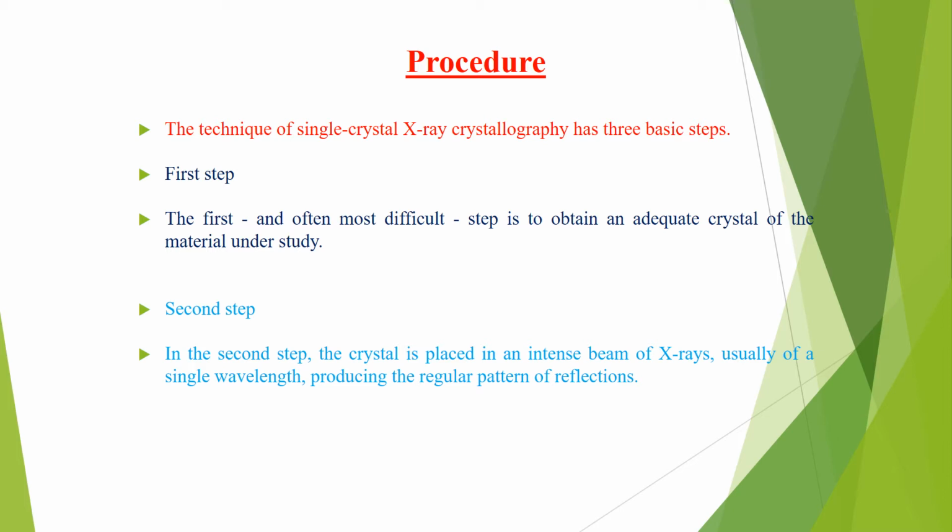That means in this step we have to obtain an adequate amount of the crystal that we have to study using this technique.